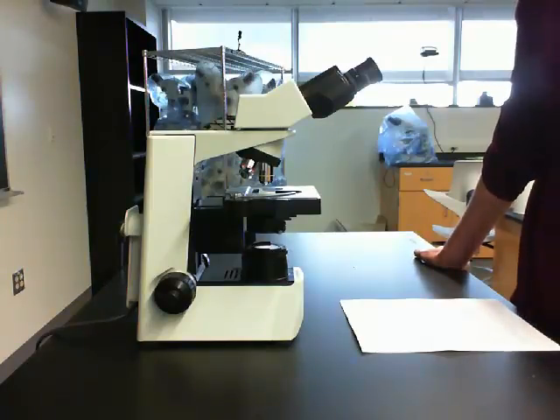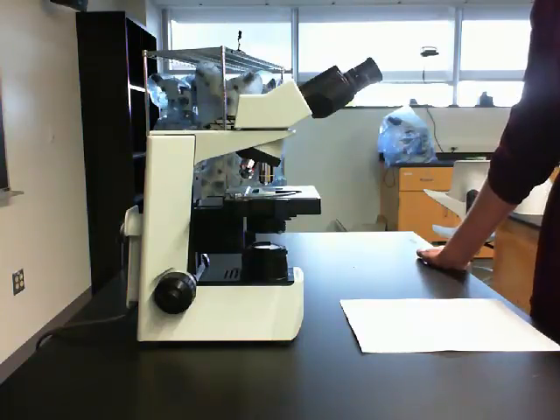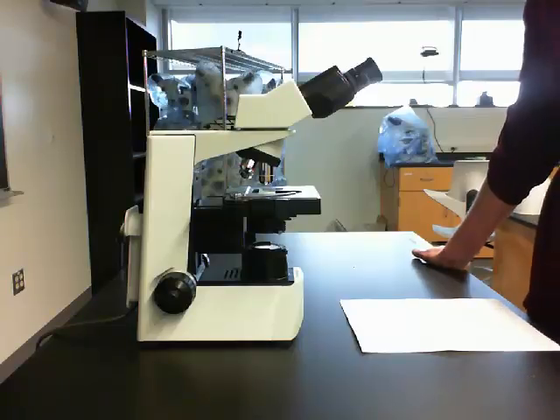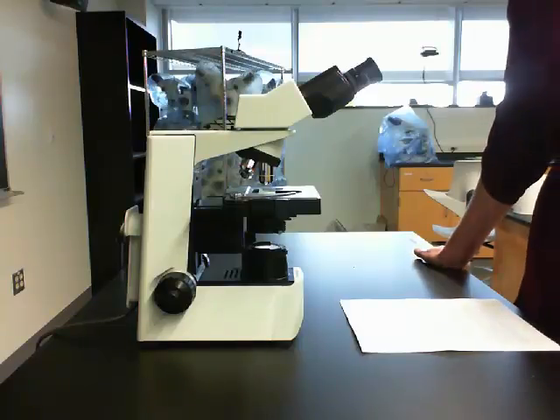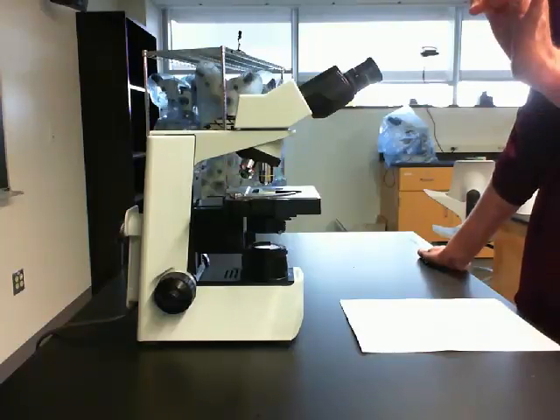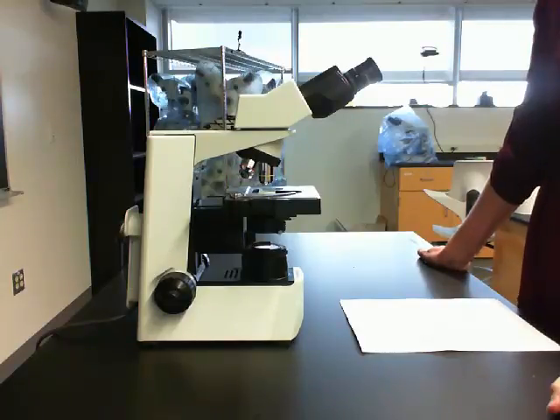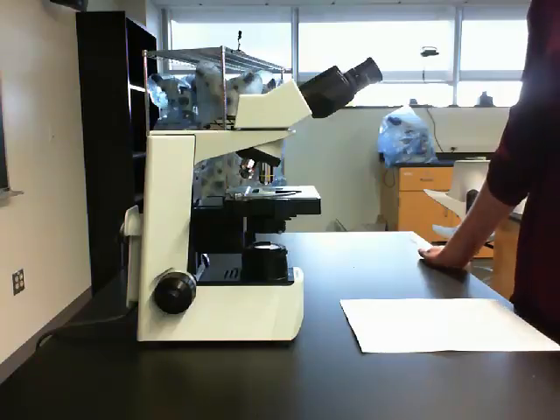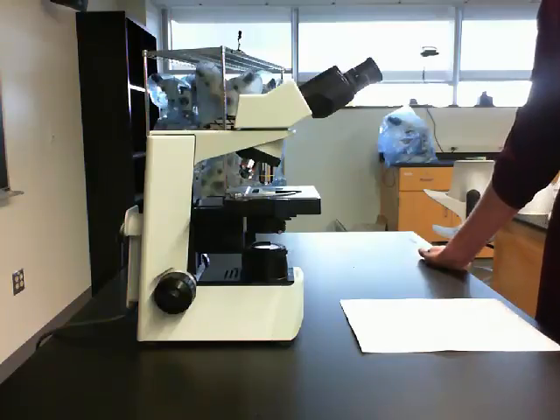Let me remind you that the brightest light is not necessarily the best light. You want to make sure the light intensity is appropriate for the image that you're looking at, as well as for the comfort of your own eyes. You're going to want to move that condenser to determine how focused you want that light to be on that very specific part of your specimen, and you're going to want to move that diaphragm. Play with it, you'll see why. And you'll want to adjust these each time with different specimens to get the appropriate amount of light coming through the specimen that you are currently observing.